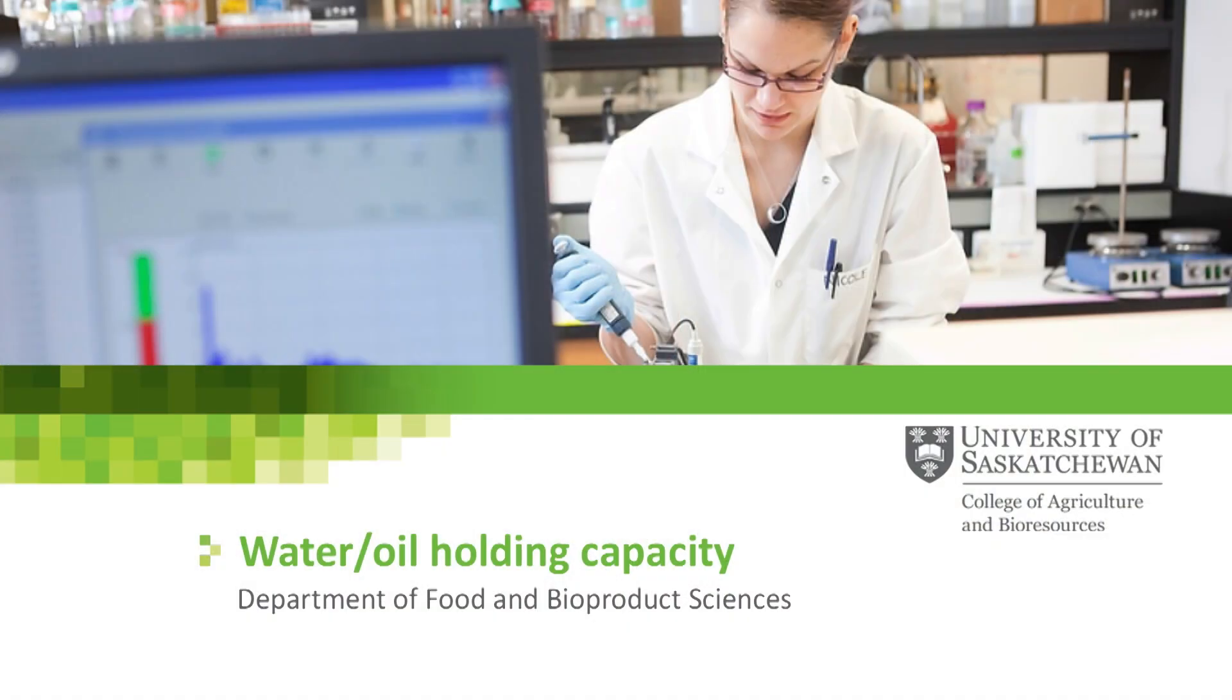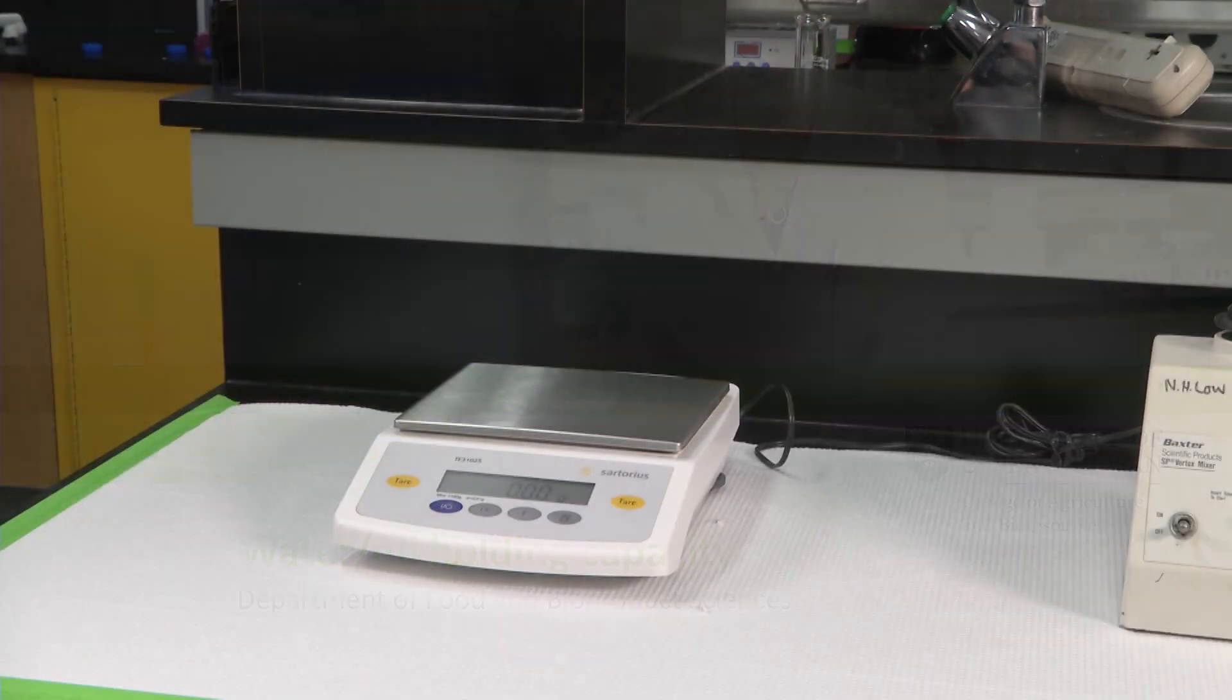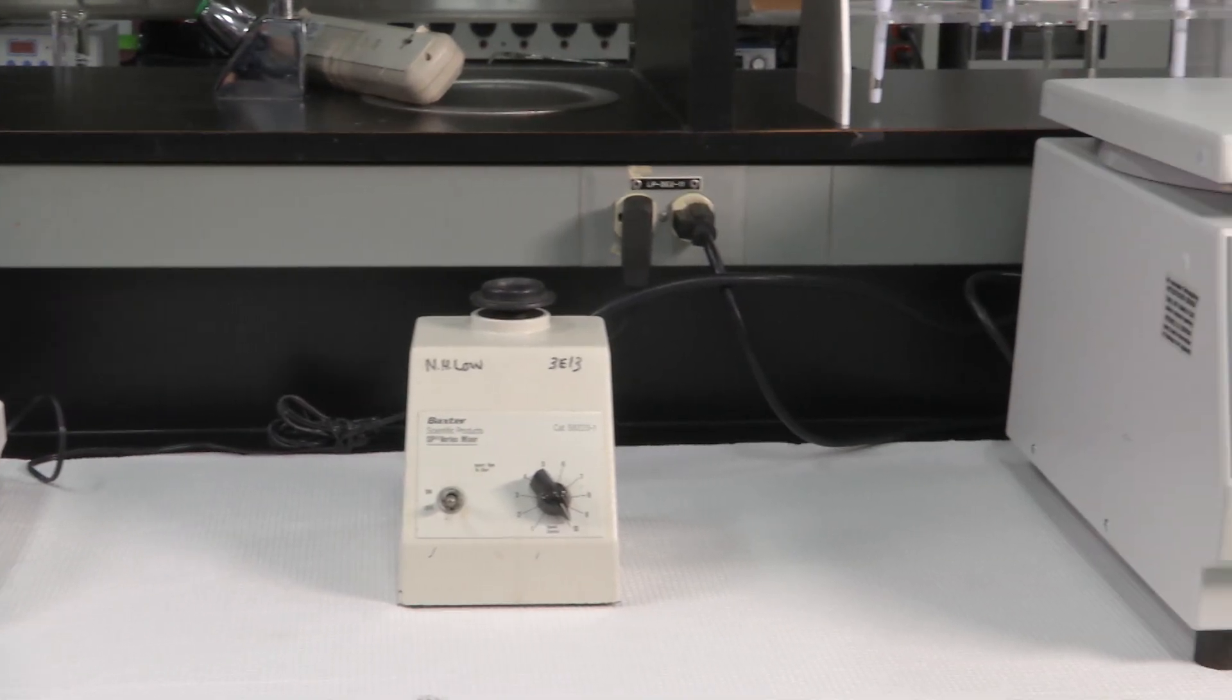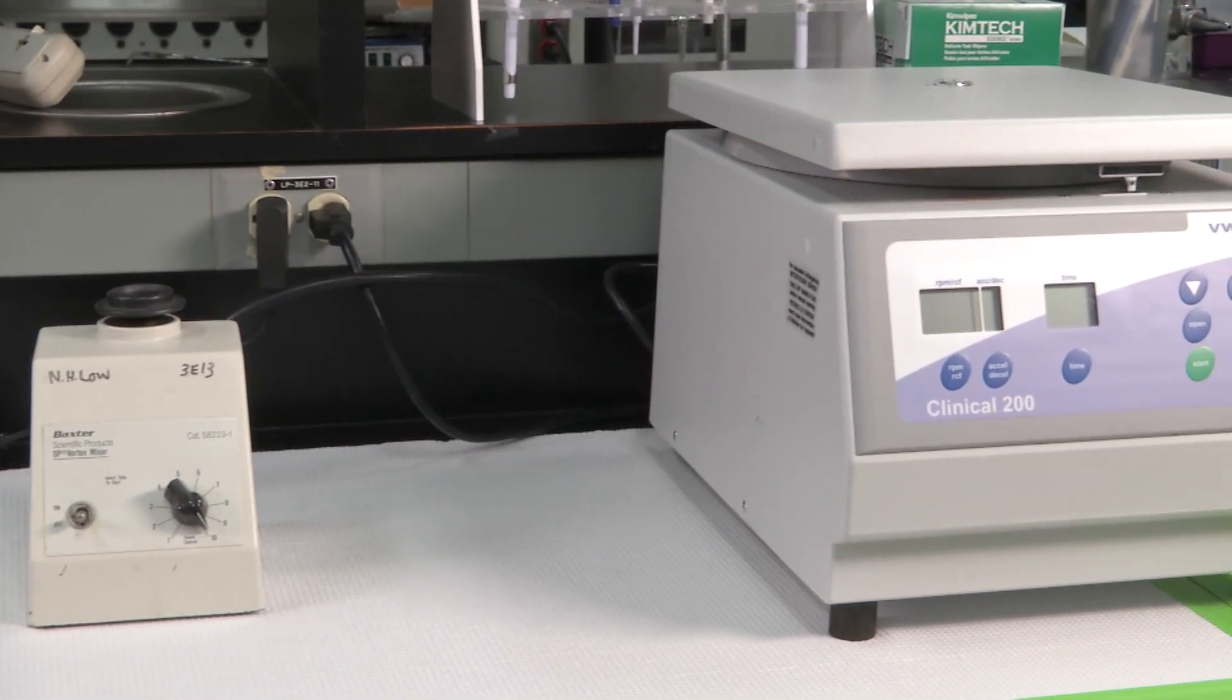But let's see how we measure it. Let's demonstrate. For this test we will need a balance, a vortex, and a centrifuge.